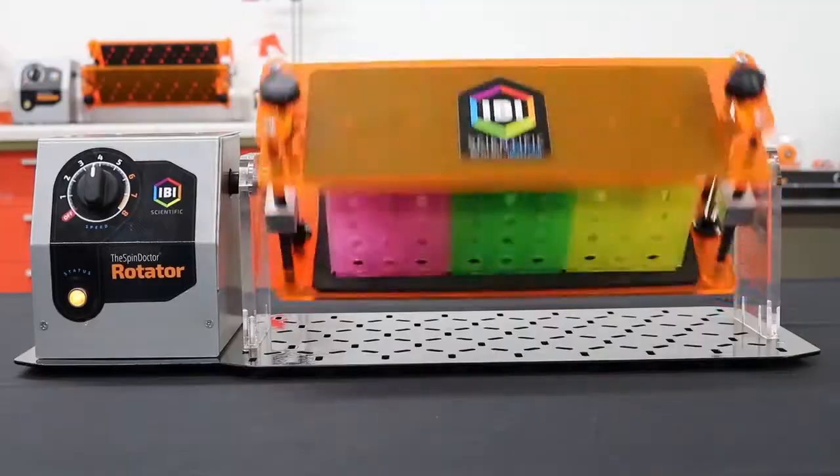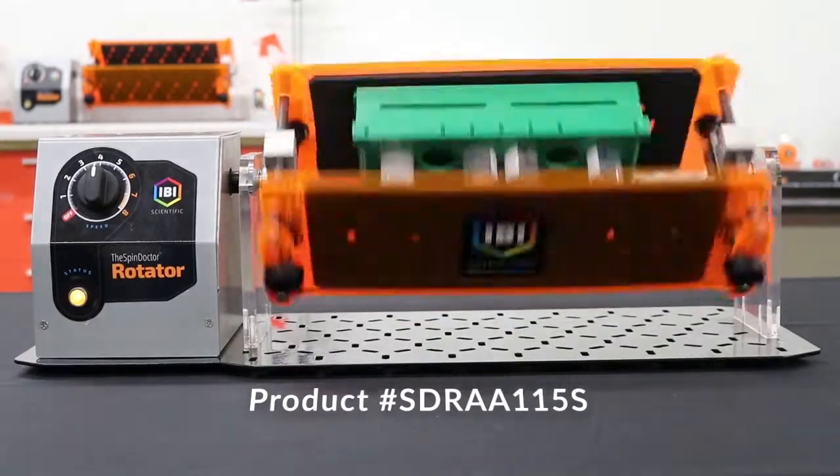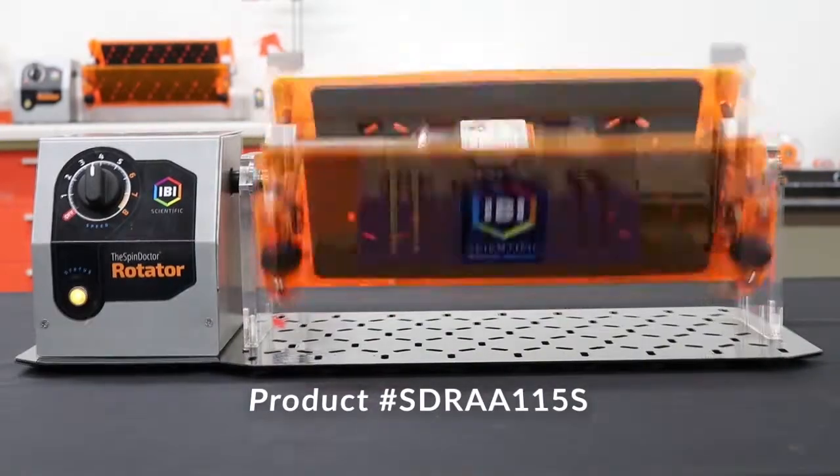The IBI Scientific Spin Doctor is a rotisserie style tube rotator that will accommodate nearly any type of tube rack. Now you can save time by leaving your sample tubes in your favorite tube rack.